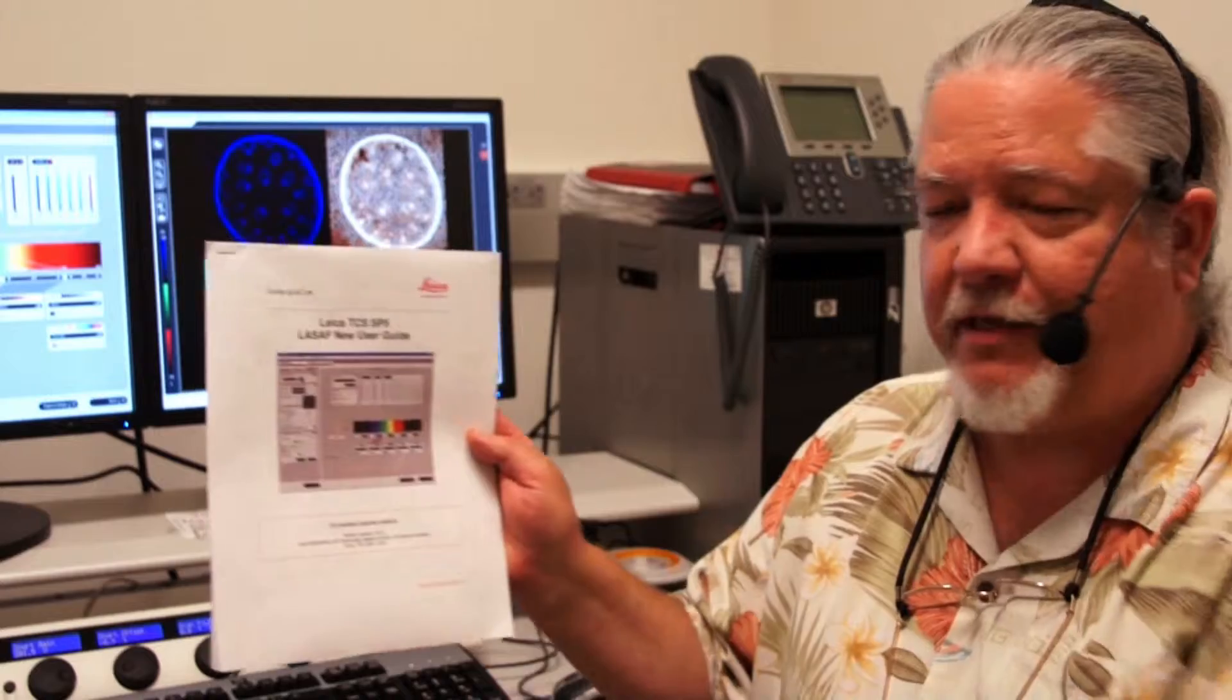Up till now we've covered a great deal of complex settings on the LASAF software. This can be a little overwhelming, but we've prepared a quick start guide for you to use when you come to the laboratory. It's a whole menu of all the functions that we've shown you today. You can take this home with you and study it and bring it back when you work with the microscope.